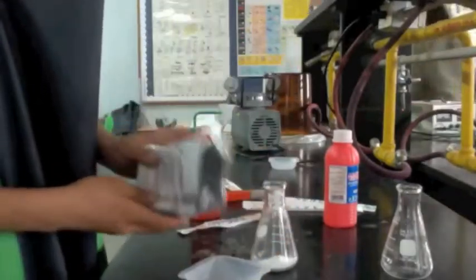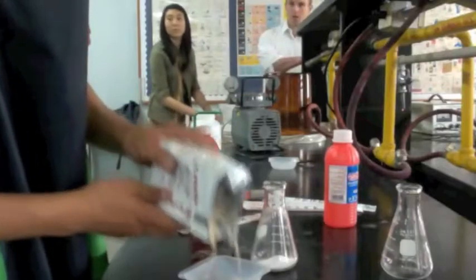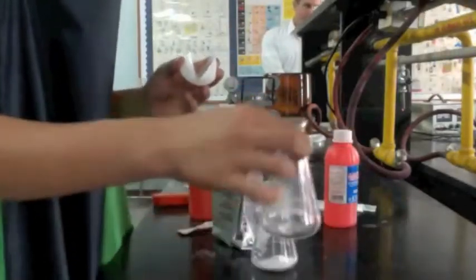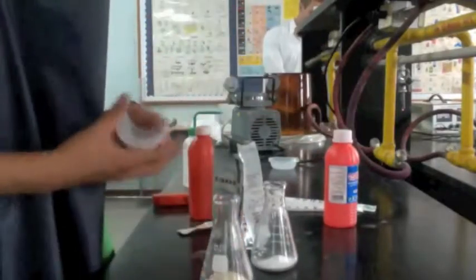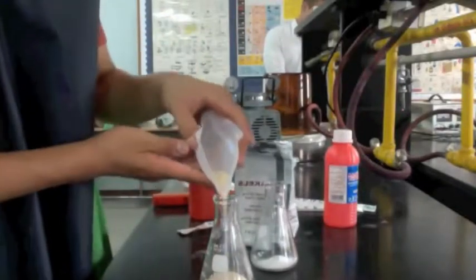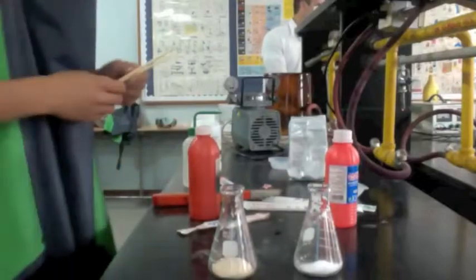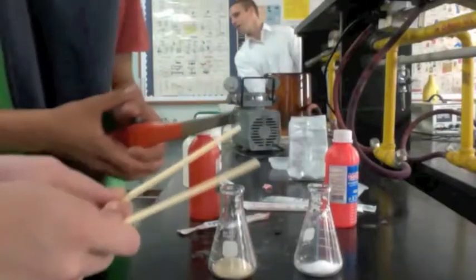Now we have this dry yeast, which we measure out in the other clean weighing tray. And again, this will go in the other dry clean flask, which we will be mixing to produce oxygen. We pour more to ensure that there's enough oxygen to ignite the ember, which was another problem that we encountered during previous trials. So now we're going to light these two wooden chopsticks on fire using a lighter.